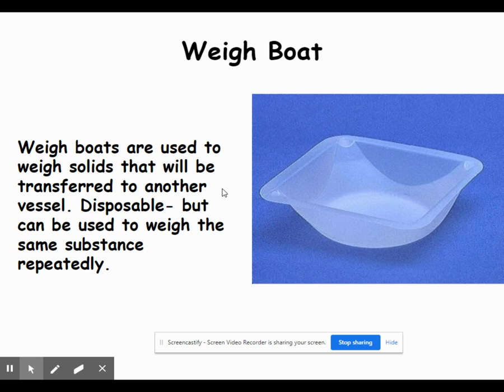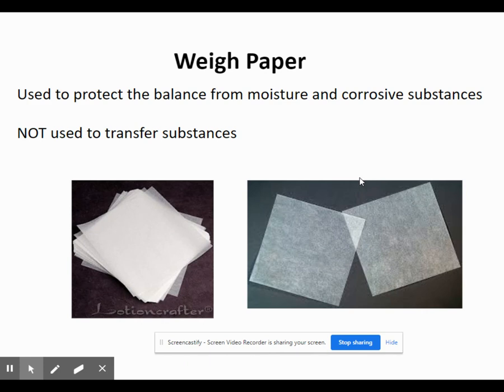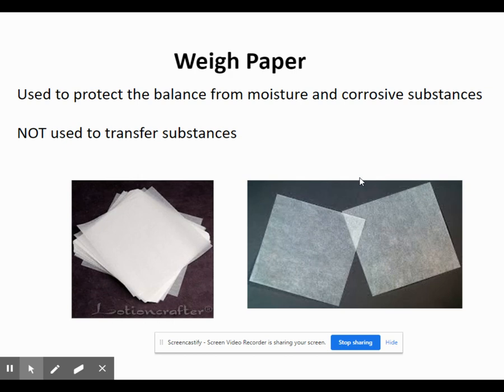A weigh boat is a small boat-shaped piece of plastic used to hold chemicals for weighing. You place the weigh boat on top of the balance, press the zero button to subtract out the mass of the weigh boat, then put the chemical inside to weigh it — that way we don't place chemicals directly on the scales and risk damaging them. These are disposable plastic but can be reused if weighing the same chemical repeatedly. An alternative is weigh paper, which is a small piece of wax paper that serves the same protective purpose. The main difference is that weigh paper is not sturdy enough to transport substances across the lab; weigh boats are far more suitable for that.